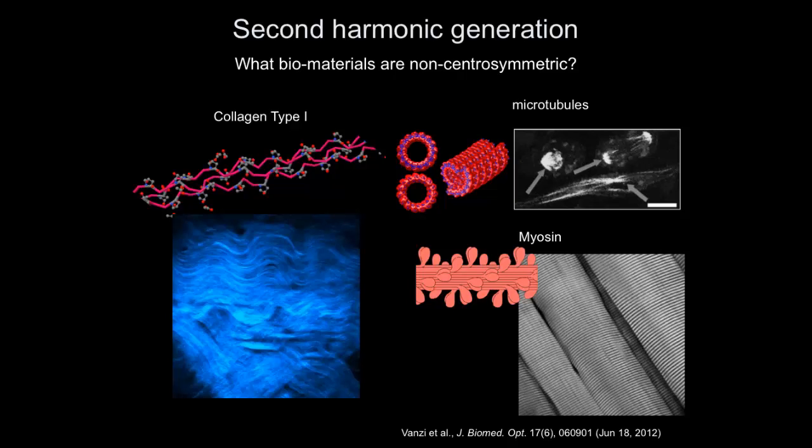In any other direction, it cancels out, because this is a triple helix, which is isotropic and has rotational symmetry. So only on this axis you retain a non-centrosymmetry. And that's why these lines here really correspond to the long axis of the molecule. Now, if you rotate a molecule like this, and you keep the light like that, you shake the electrons in this way, you won't see any signal. You have to move the electrons like that to drive them along the long axis. So yes, if I rotate either the sample or my polarization of light, the contrast here would change.